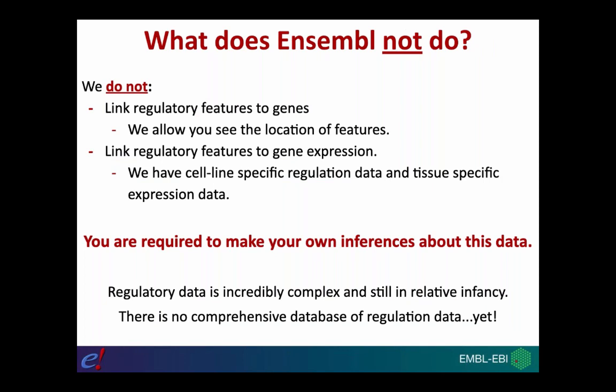The most important limitation to highlight is that Ensembl does not link regulatory features to genes. Ensembl has a gene build and a regulatory build, and these are two independent processes. You can see genes and regulatory features aligned to the genome in the same view, but there is no direct association Ensembl makes between them. If you want to link regulatory features to genes, you have to make this inference yourself using cell-line-specific regulation data and tissue-specific expression data.